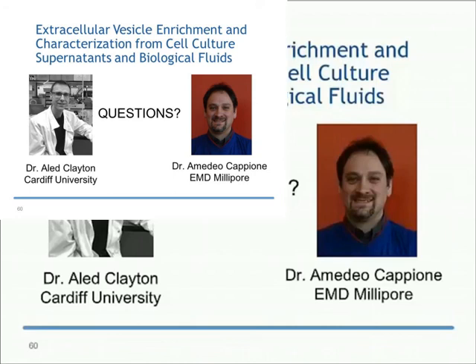Okay, this next question is directed to Dr. Cappione. It says, have you compared the biological activity of EVs after the Amicon method versus ultracentrifugation?